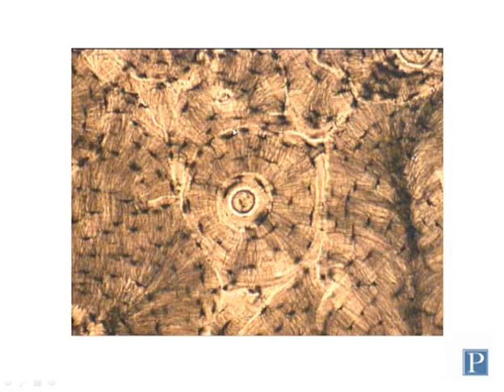Here's a higher magnification view of the inner part of the bone, and here we can see the actual shape of the osteons here. So this is a single osteon, this structure, and we can see it's composed of multiple concentric ring-like structures or lamellae of bony matrix. These are called concentric lamellae, and so you can count these different rings here.